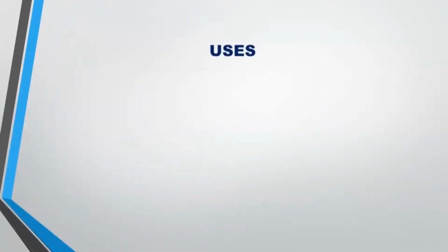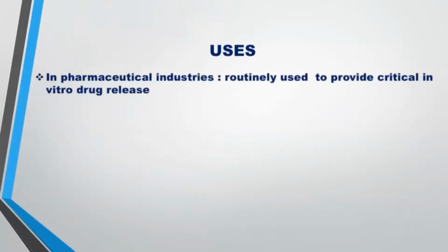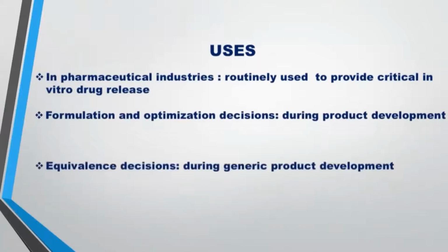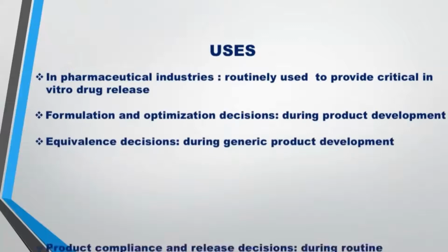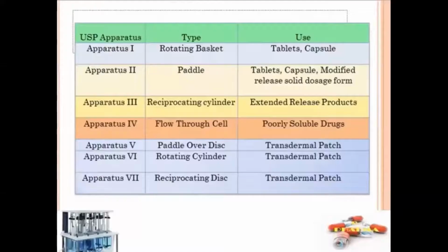There are various uses of the dissolution apparatus in the pharmaceutical industry. First, drug dissolution testing is routinely used to provide critical in vitro drug release information for quality control purposes. Second, formulation and optimization decisions during product development. Third, equivalence decisions during generic product development. Fourth, product compliance and release decisions during routine manufacturing.